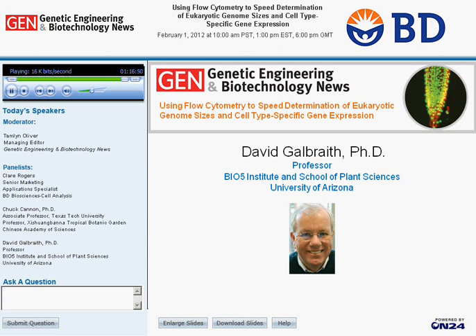But with living cells, then you've got to get the fluorescent dye into the protoplast. And at the moment, I don't think people have been able to find dyes that do that particularly well. We've occasionally tried using some of the supposedly viable DNA stains with protoplasts, but we haven't come across anything that works particularly well at this point. But it's an interesting idea, and it would be worth pursuing.